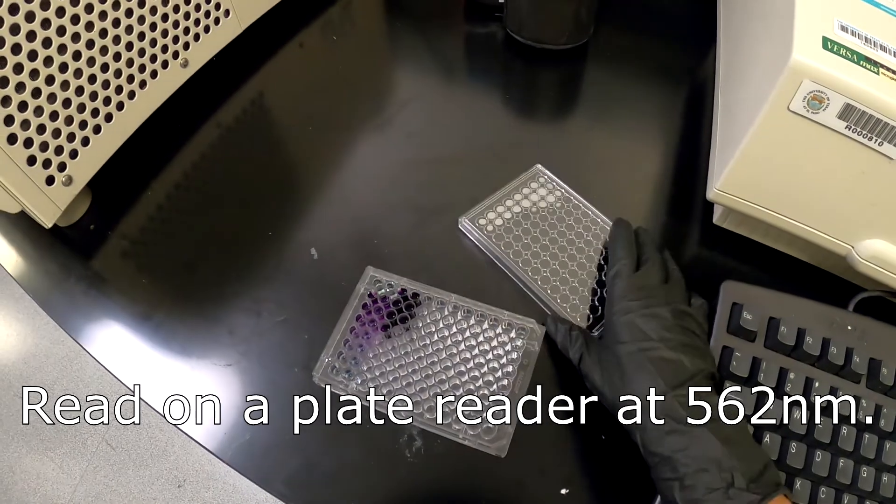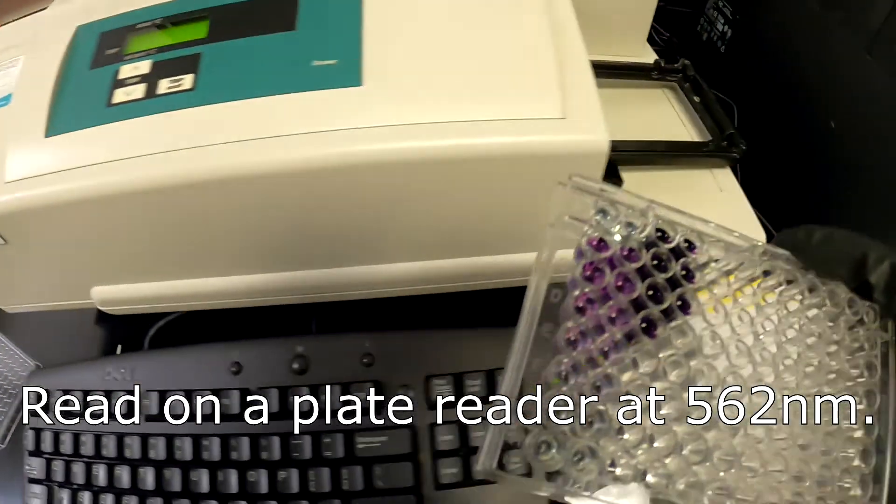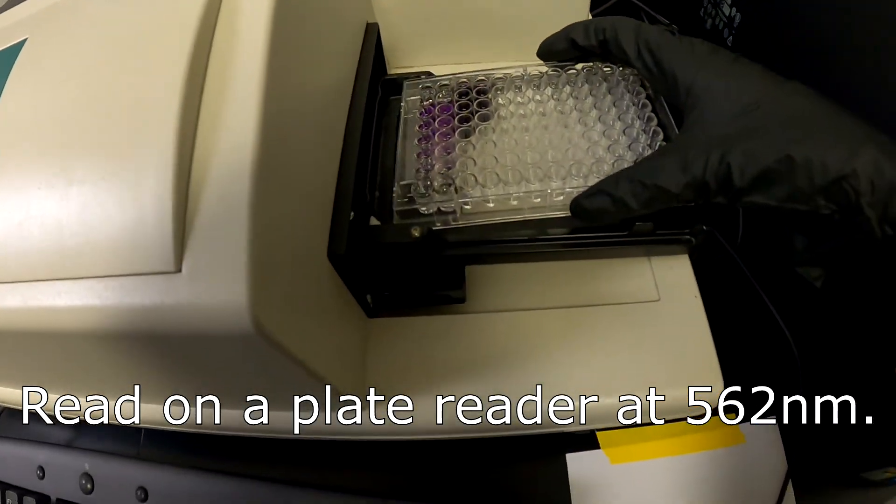The plate was then covered and incubated at 37 degrees Celsius for 30 minutes in order to allow the reaction between copper and BCA to occur. Incubating the BCA assay at higher temperatures is recommended as a way to increase assay sensitivity while minimizing the variances caused by unequal amino acid composition. The plate was then read on a spectrophotometer at a wavelength of 562 nanometers.